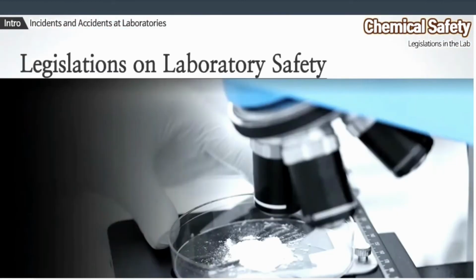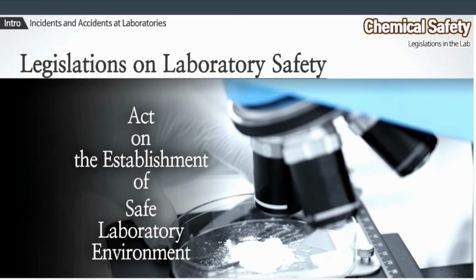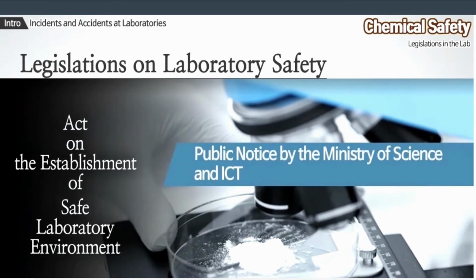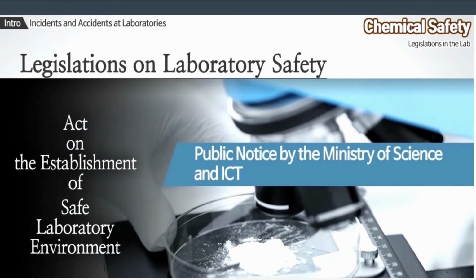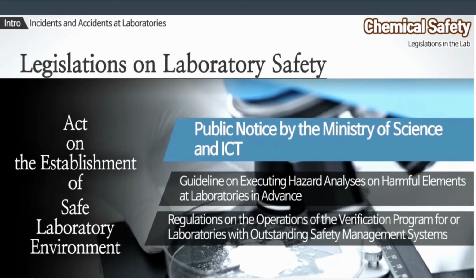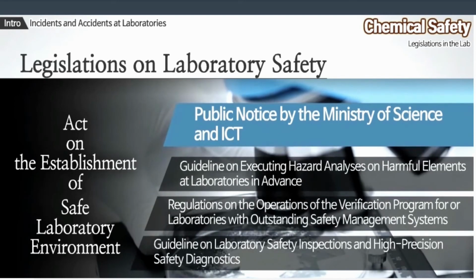The next legislations on laboratory safety are pursuant to the public notice by the Minister of Science and ICT in accordance with the Act on the Establishment of Safe Laboratory Environment: the Guidelines for Preliminary Risk Analysis of Hazard Factors in Laboratories, operation of a system for certifying exemplary laboratories in safety management, and guidelines for safety inspections and thorough safety inspections.